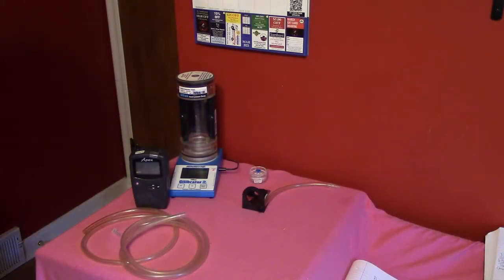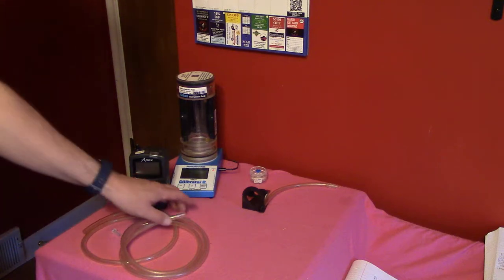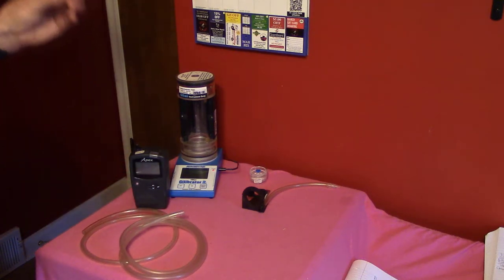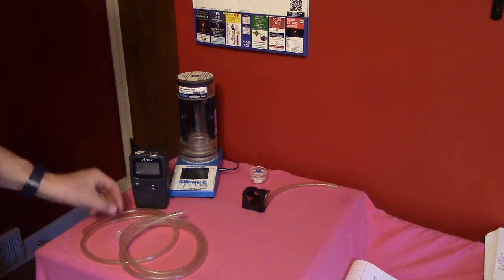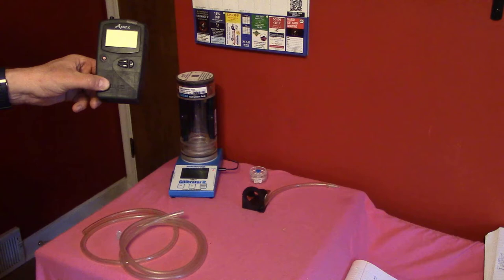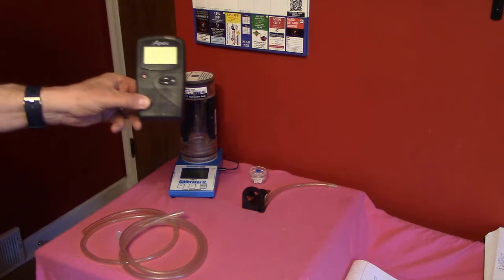We're going to start by doing a calibration of the sampling pump with our filter that we hope to use in sampling, or the same type of filter. What I have set out here is some tubing, a connector, and a sampling pump that will pull air through a sampling filter.